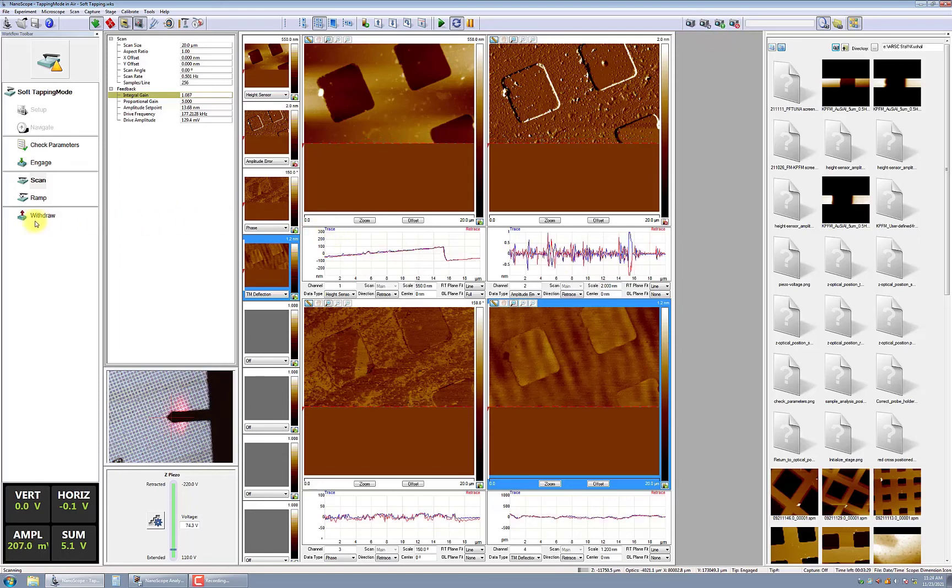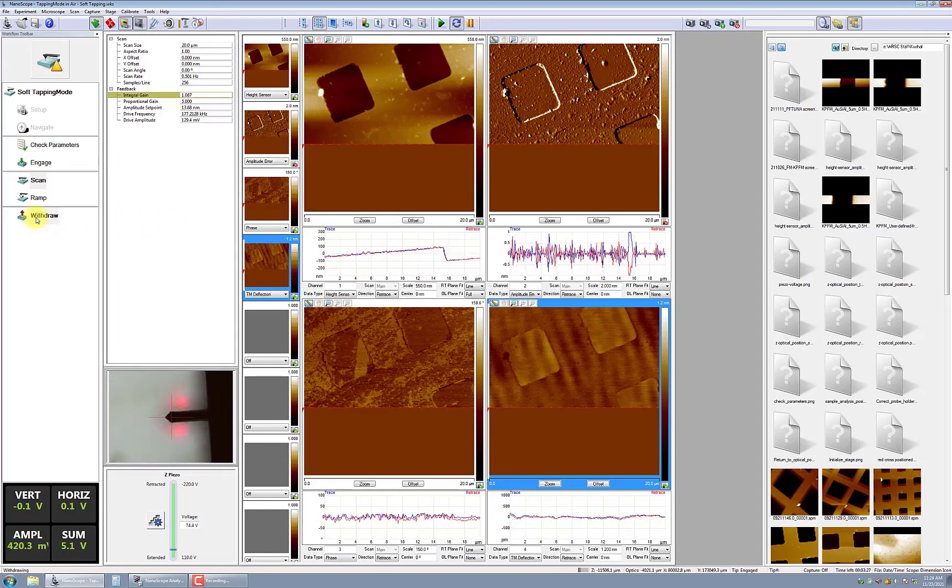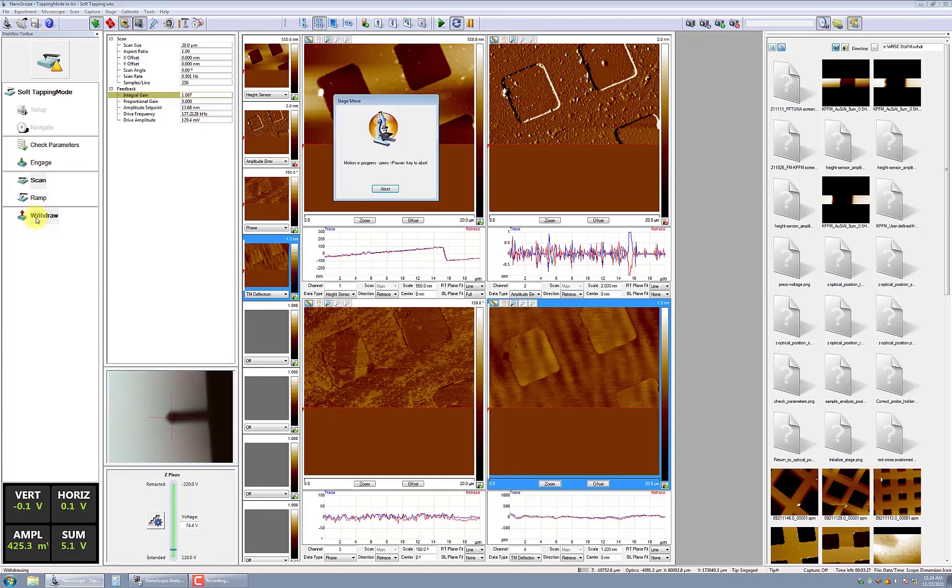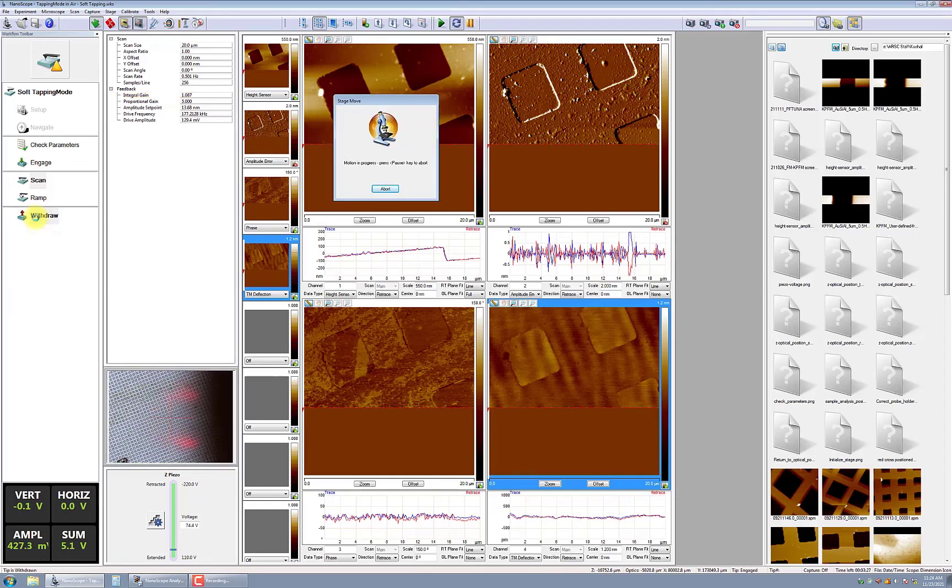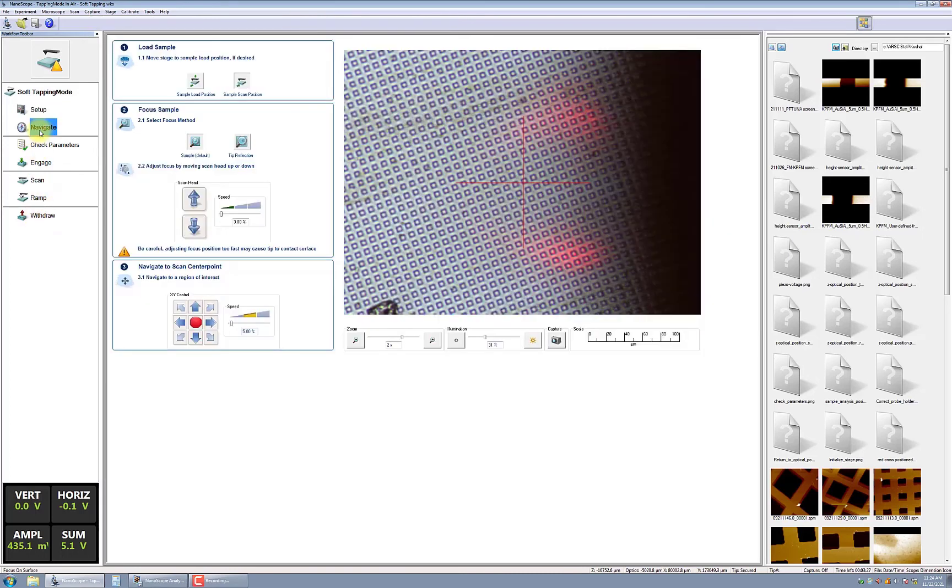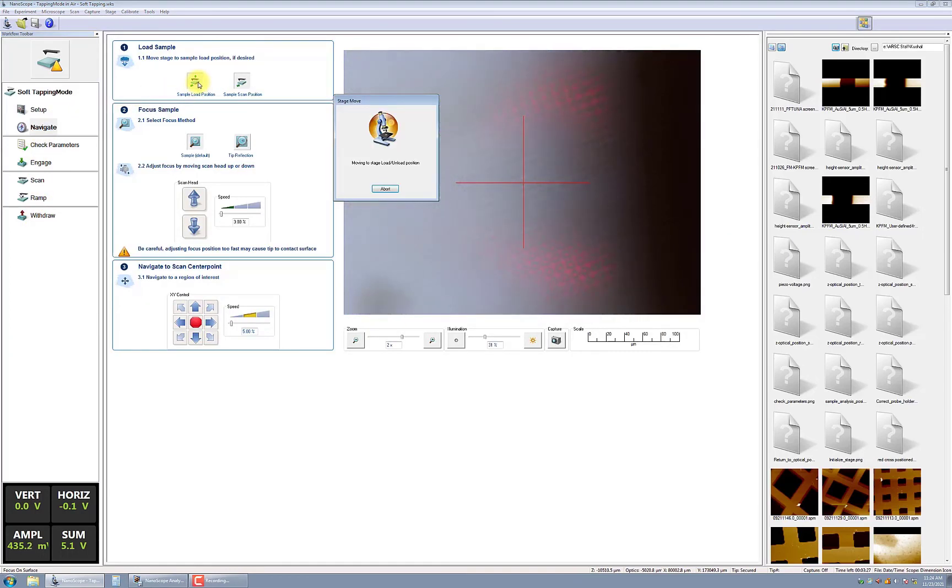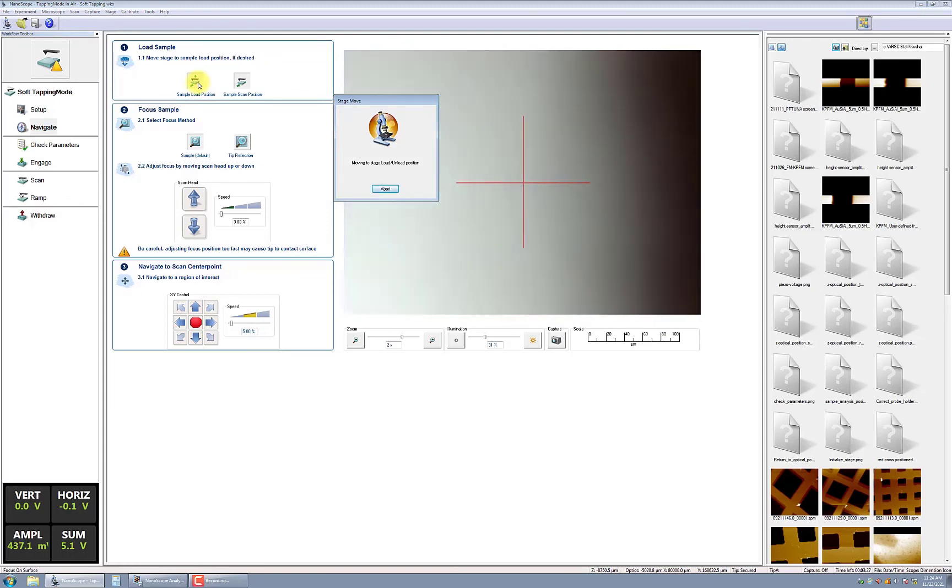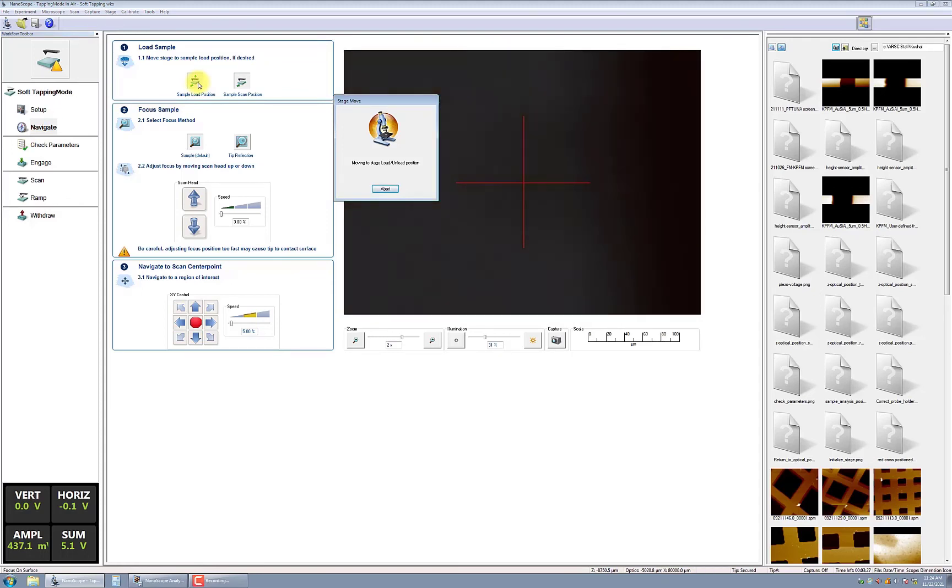Once you've acquired and saved your data, it's time to idle the equipment. Click on Withdraw from the Workflow menu. Then select Navigate and click on Sample Loading Position to safely remove your sample without the risk of accidentally bumping into the scan head or probe.